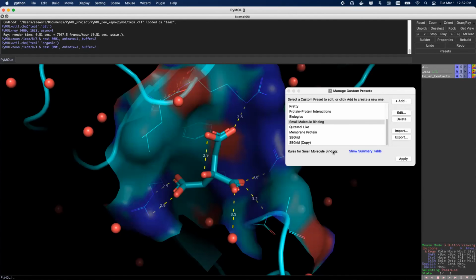Thank you. This is just a general question, not so much about the presets. I tend to use the command line. I wasn't able to find a way to change the settings differentially. Like, for example, when we change the settings to label size or font size, all the labels are changed. Is there some way to selectively change them?